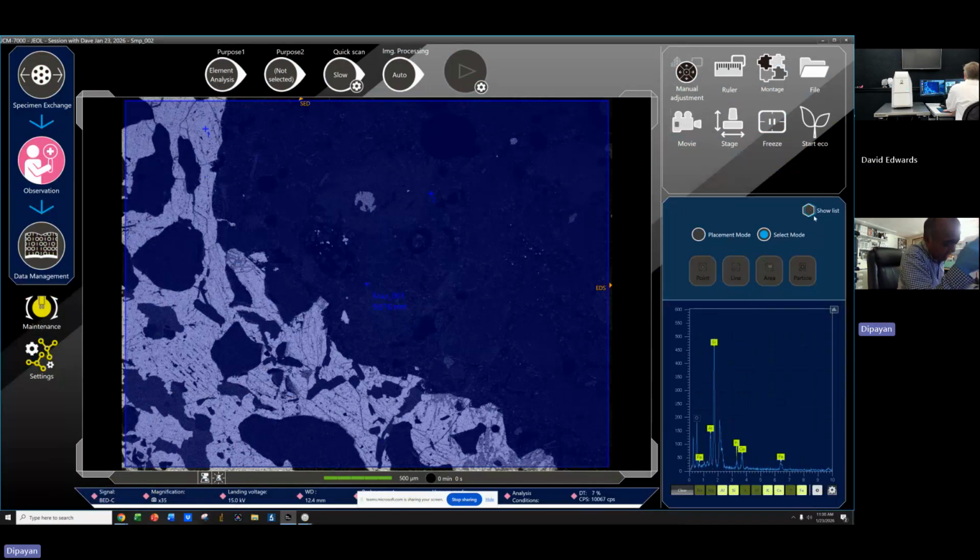And in the IT 200, on the left side, you have some buttons for the point and the area where you can choose that point, so it will give you the select mode. In the IT 200 platform, you don't have these, but it was very clear whether you want point live mode or analysis mode. Yep. You know, now this is where I was confused.